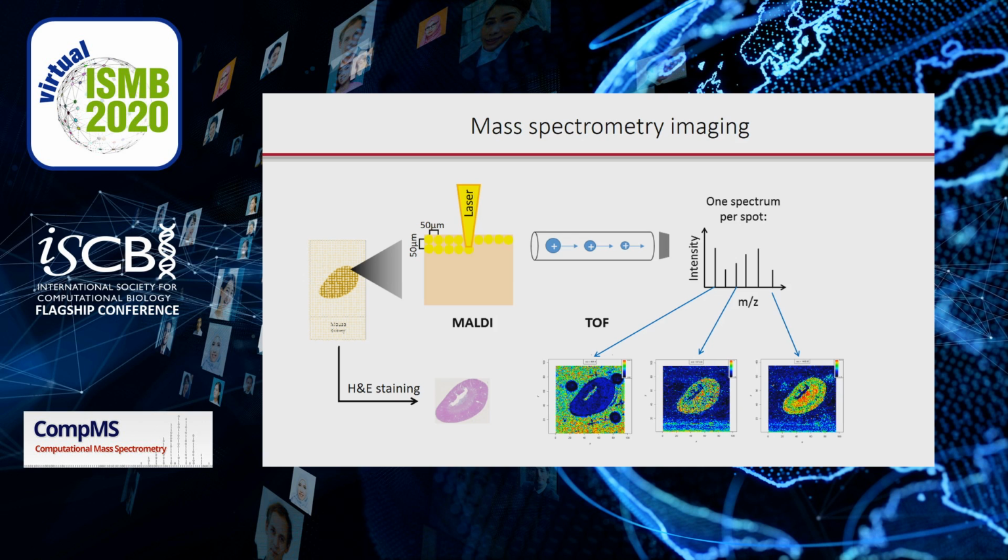MSI can be performed with different types of mass spectrometers. The most common are MALDI-TOF devices. The laser scans over thousands of tissue locations in a grid with a spatial resolution in the lower micrometer range. In each location, a full mass spectrum containing thousands of analytes is recorded. The hyperspectral data is later assembled into distribution profiles for each analyte. Those profiles can be compared with the optical image of the sample and used for further statistical analysis.